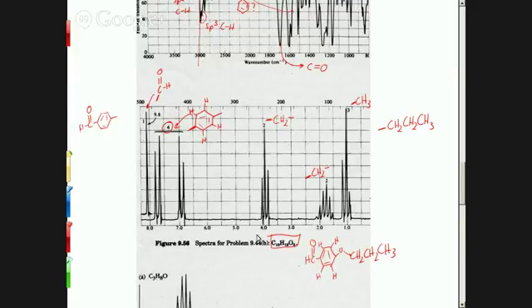Well, you use the chart where it's necessary. Especially in the low end, down here, there are just so many things that can be there that this chart is not so helpful. On the high end, it is. So, for instance, you have one that's up here close to 11, and you'll notice there's only one thing that could possibly be that high, which is a carboxylic acid. So you know with pretty good certainty what that is. But down in that 2 range, there are so many different things that the chart is not useful. Same thing in the aromatic range, there's only aromatic stuff in that range.